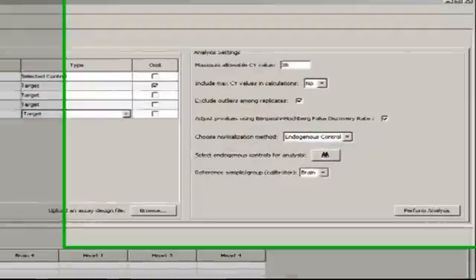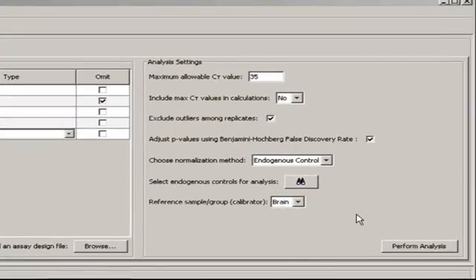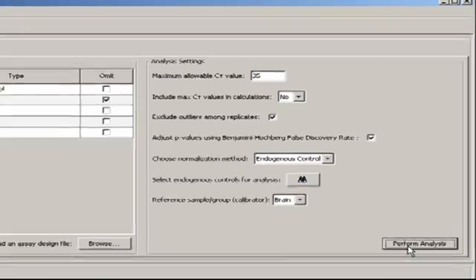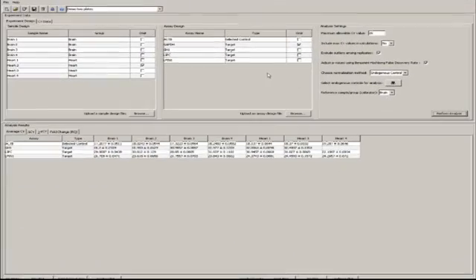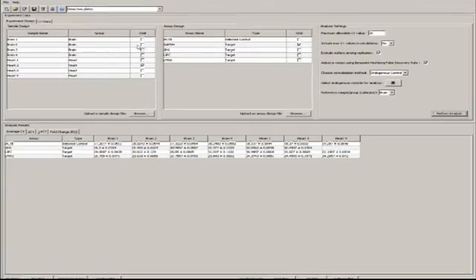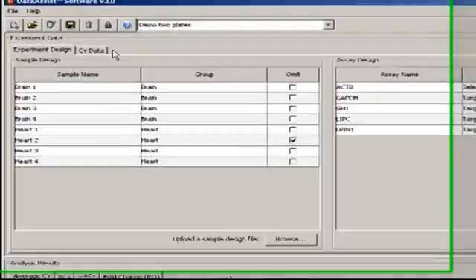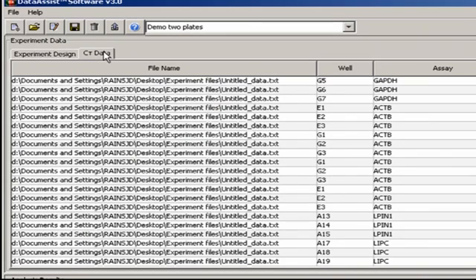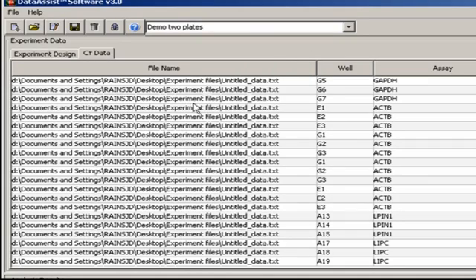As soon as we're ready to analyze, we simply go over here and hit perform analysis. Let's click on the tab labeled CT data since this lists all of the imported data well by well. The first column is the name of the real-time study file for each data point. Since I imported a single study file, the name is the same all the way down. I'll just shrink this column a little bit.